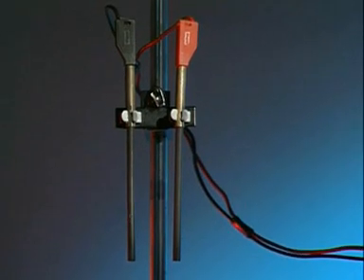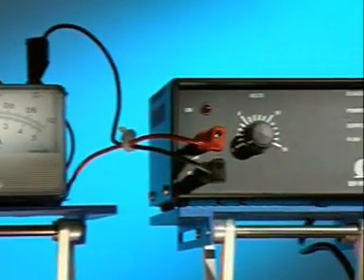A circuit is set up using two carbon electrodes, an ammeter and a power supply.